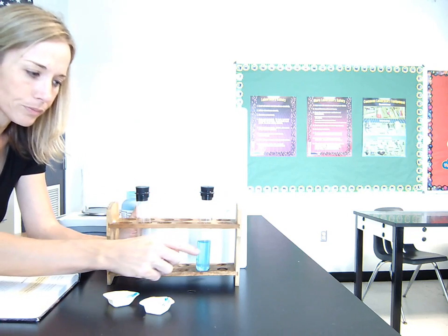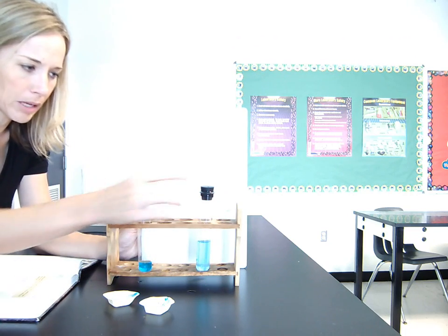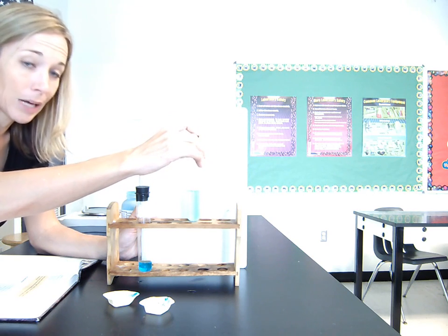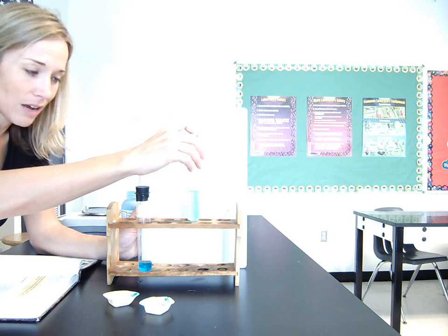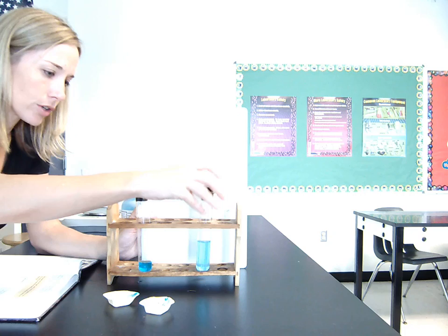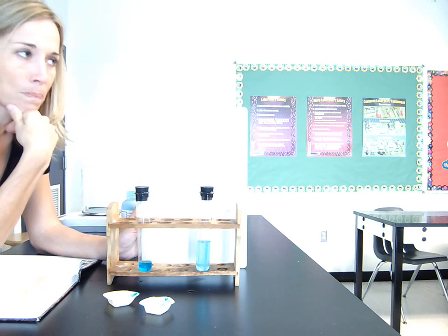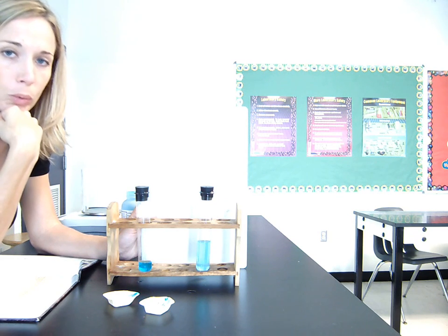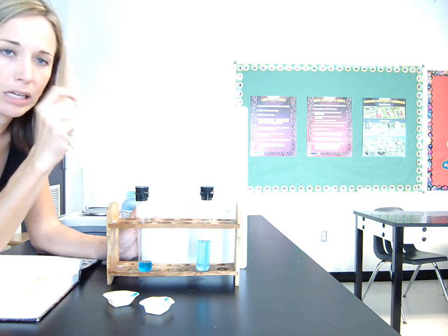If I pour, let's just say I pour half into one and half into other, that might make it even easier. If I took this solution and I pour half of it into one dish and half into another dish, I would expect both of those portions to have the same amount of dissolved material. It's kind of like if you think about iced tea, for example. If you make the powdered kind of iced tea, and you take water and you put the powdery mix in there and you mix it up and you mix it up, as long as you mix it up really well, no matter how many glasses of iced tea I pour from that pitcher, they should all taste the same because they should all have the same amount of iced tea mix dissolved in that glass.